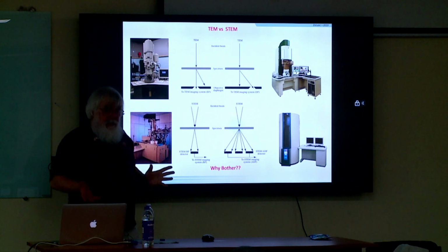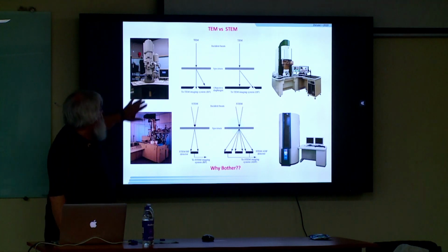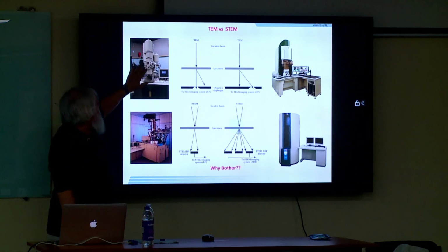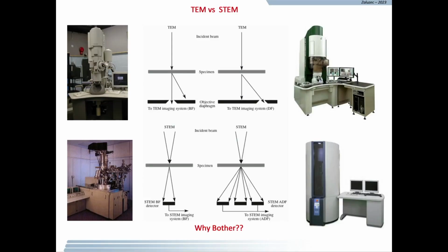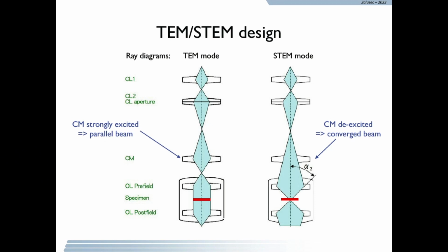Is there a reason to go from TEM to STEM? And the answer is yes. Are the instruments similar? Yes. Can you get an instrument that does both TEM and STEM? Today, the answer is yes. There are dedicated STEM instruments that only do STEM, and dedicated instruments that only do TEM.